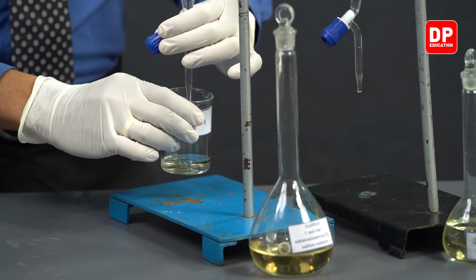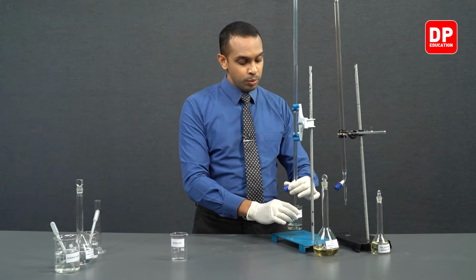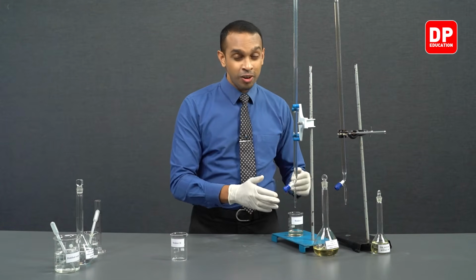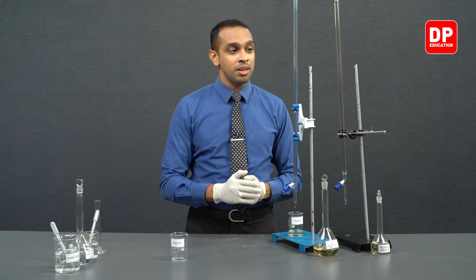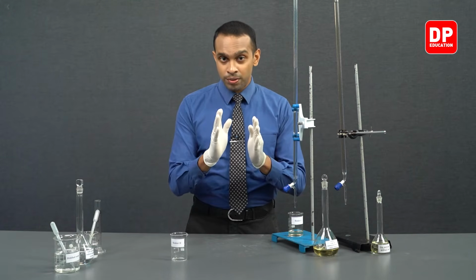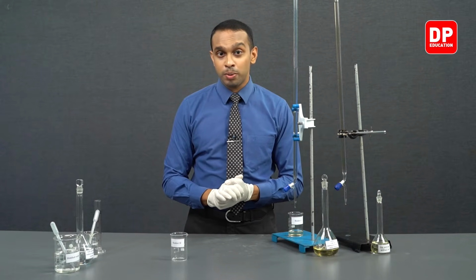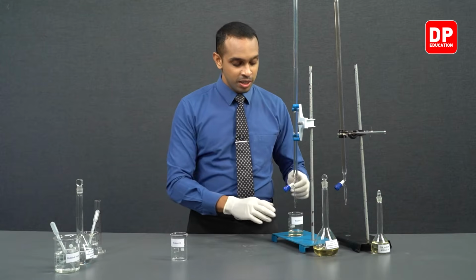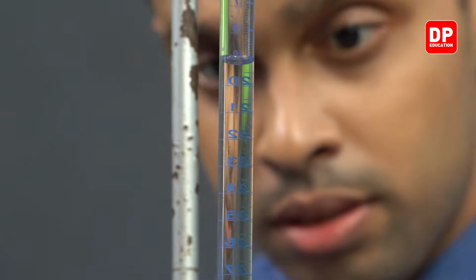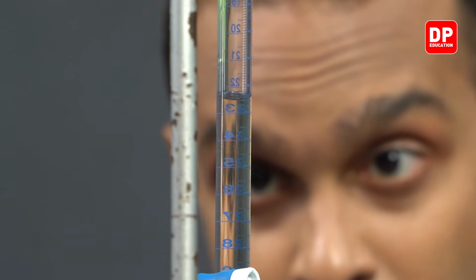Now keep in mind, students, we will not be using this burette throughout this practical, in the sense we will not show you the measuring of each of these solutions throughout this practical. We will be doing that off camera in the next repeats of this experiment, but this first reaction we will show how the measuring of different solutions is going to be done with the use of a burette. So we are using a burette so that we can obtain a more accurate volume into these beakers. We need to measure exactly 25 cubic centimeters.